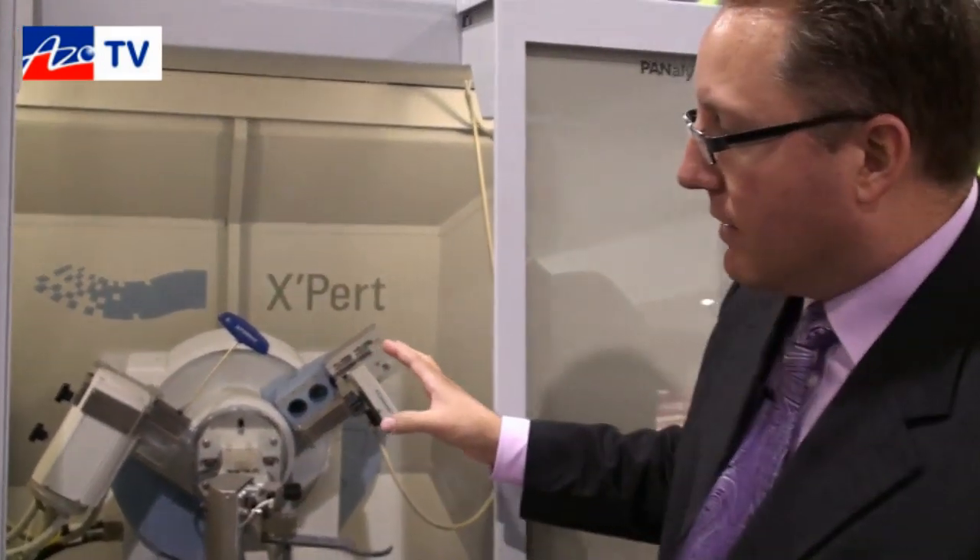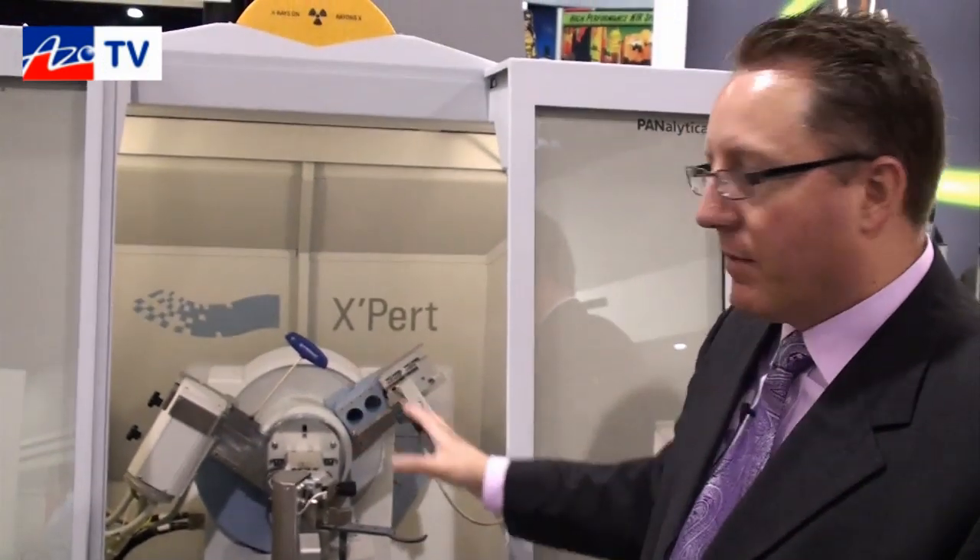The system is standardly set up in a theta-theta geometry, and it allows users to reconfigure an instrument in just minutes to give them a tailored solution for ideal data collection resolution. When we measure the lanthanum hexaboride standard from NIST, we get on this Expert Powder system a full width half-max resolution of 0.026 degrees, which sets the standard in powder X-ray diffraction in terms of resolution.